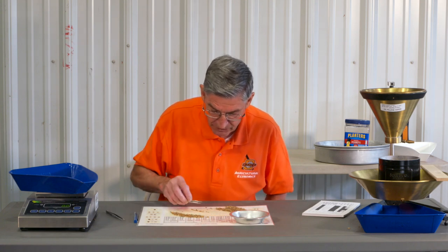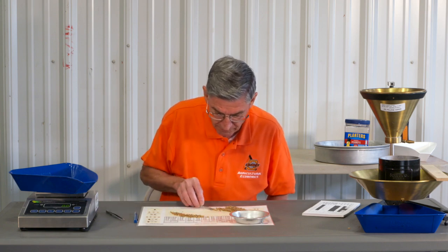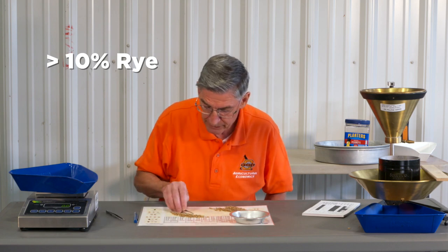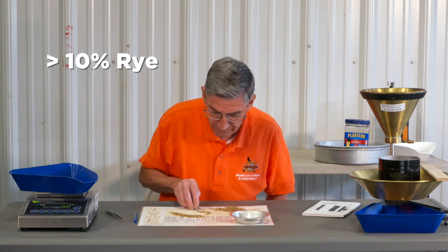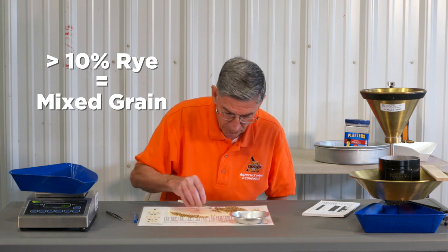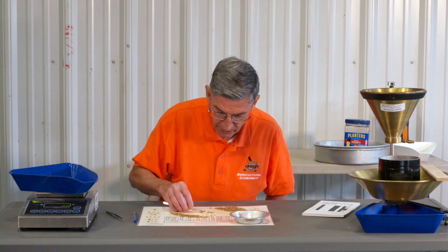To calculate the percentage of foreign material in this wheat: remember, if you've got over 10 percent rye — and we're picking out other things besides rye here — if you've got over 10 percent rye in the sample, then you don't have wheat anymore, you've got mixed grain. We'll see how this one weighs out; there's quite a bit of rye in it.